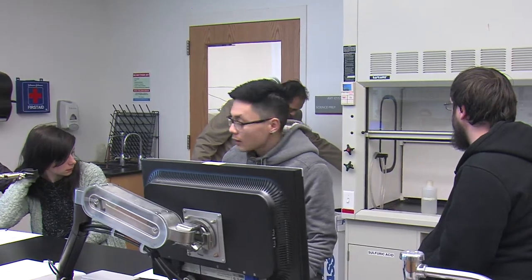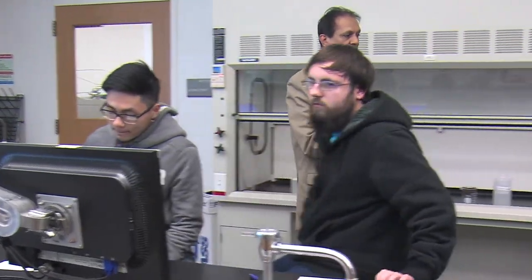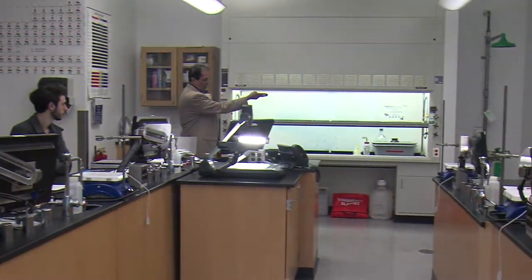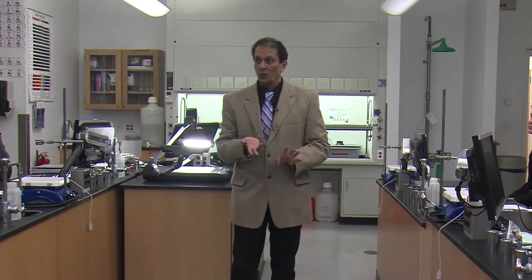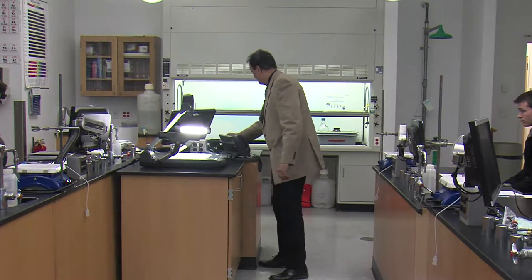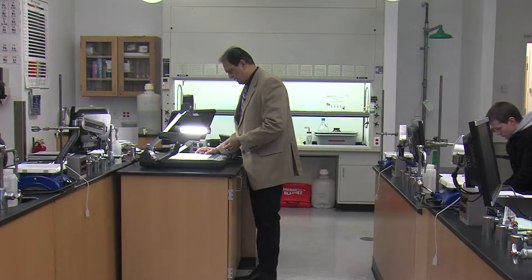You will never discard the broken glass in the regular trash, all right? This is to keep us safe, the housekeeping staff safe, all right? So if a cell phone falls in the regular trash and you have broken glass in it and you cut yourself, the next 10 days you will spend in the hospital getting tested for HIV and everything. Okay, you don't want that. Okay, you don't want to waste your time in a hospital just because you dropped your cell phone in there and somebody else had broken glass in there. Okay, so make sure that you follow that. And that is number 15, all right? Broken glass in the broken glass bucket.